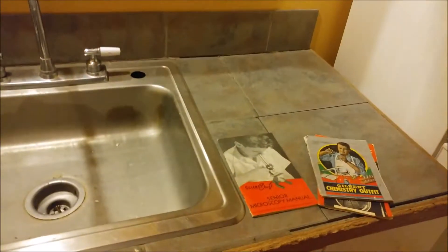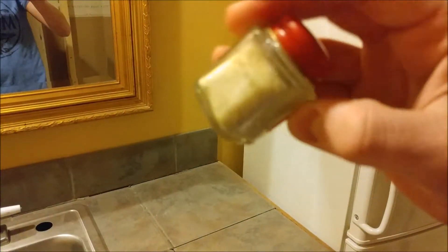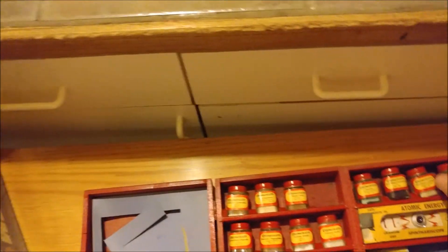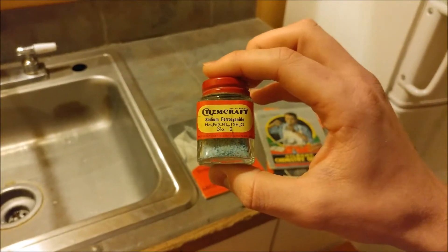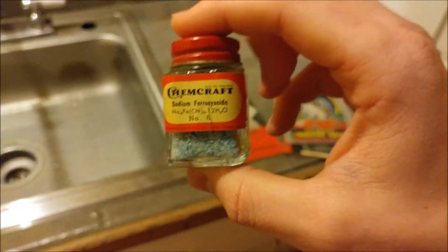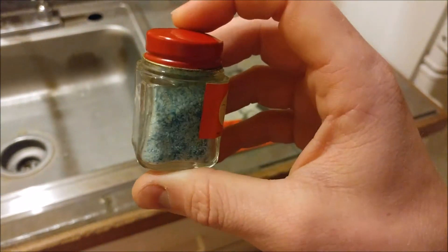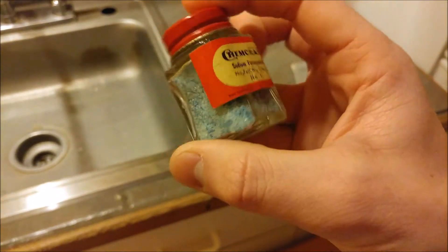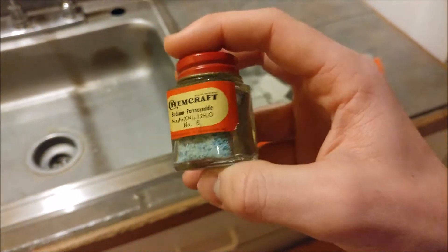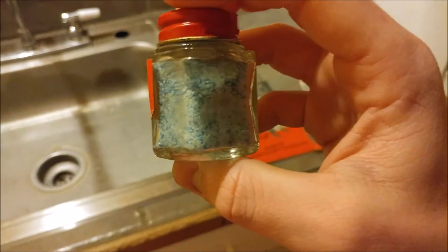Iron metal — pretty self-explanatory. Aluminum sulfate — I thought this one looked cool, but it's just a normal solution. We have some sodium ferrocyanide, which is one of the more interesting ones in the kit. Sodium ferrocyanide by itself is not necessarily that dangerous — obviously you don't want to eat it, but it's not cyanide-level from what I've read. It has this really cool aqua blue color — if my colorblindness isn't fooling me.